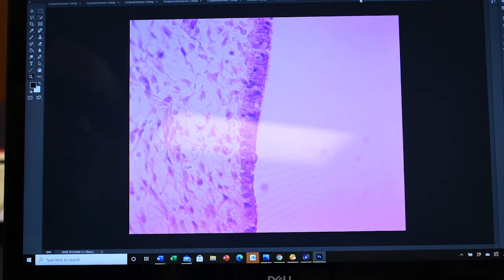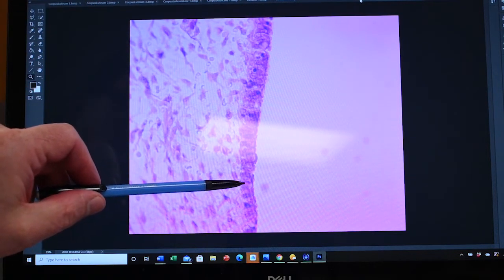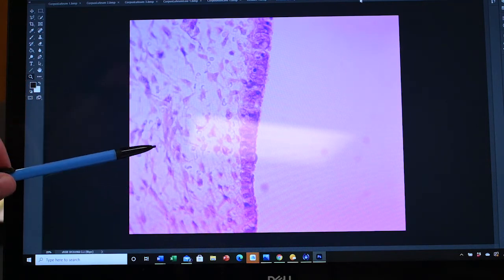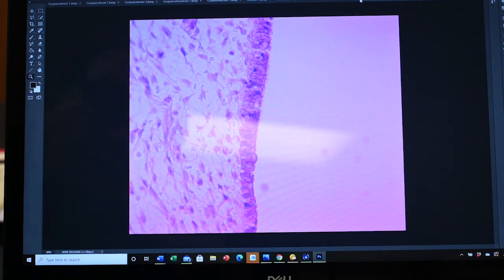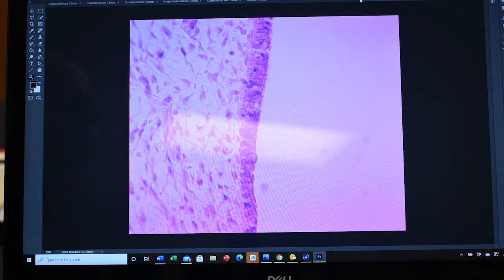Now we're looking at the uterus. This is the lining of the uterus, a simple columnar epithelium along the edge, and this highly cellular connective tissue in here. Notice that it's kind of sparse, and there are not a lot of fibers going on, just more like a mesenchyme-like tissue growing back and rebuilding the endometrial lining. Remember, this is stratum functionale, the inner portion here.